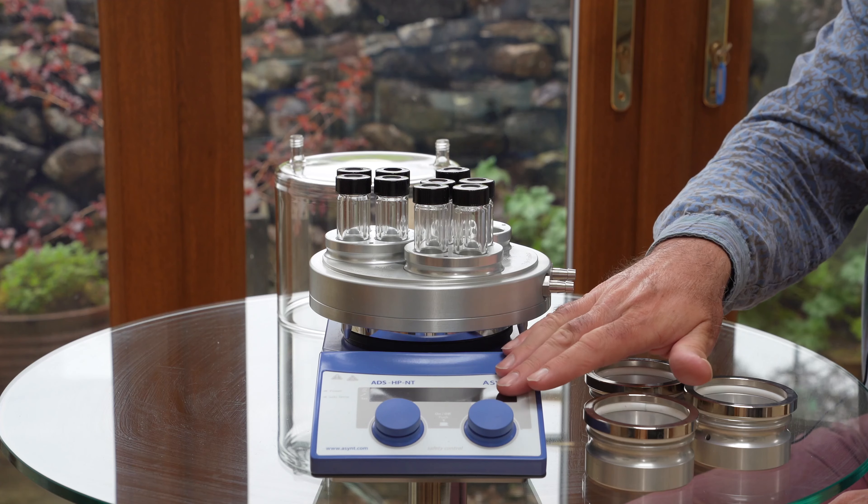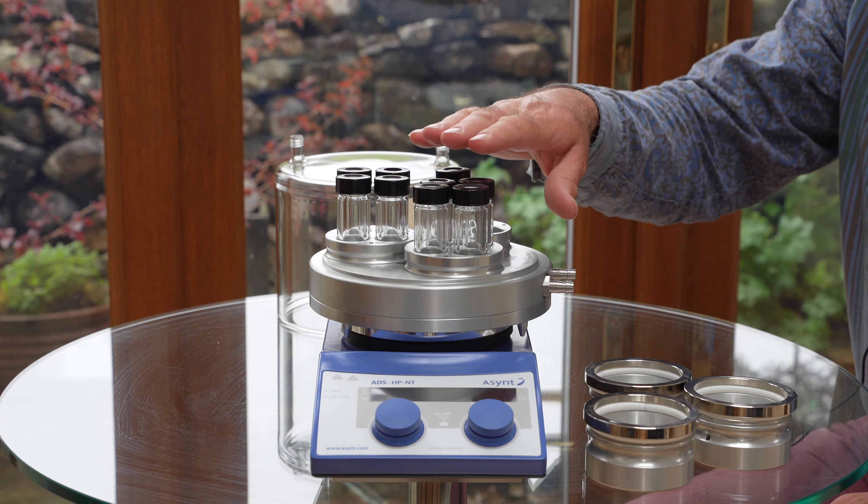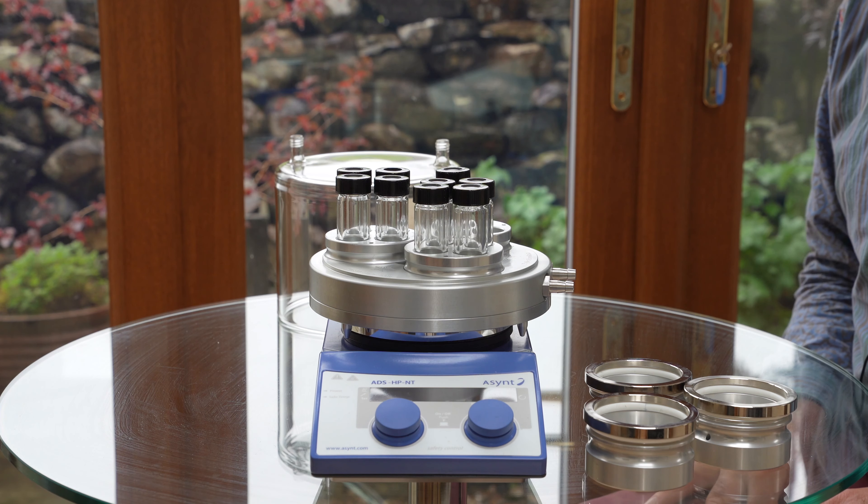We use a standard magnetic stirrer to magnetically stir, just as you do on the heating DrySyn unit.